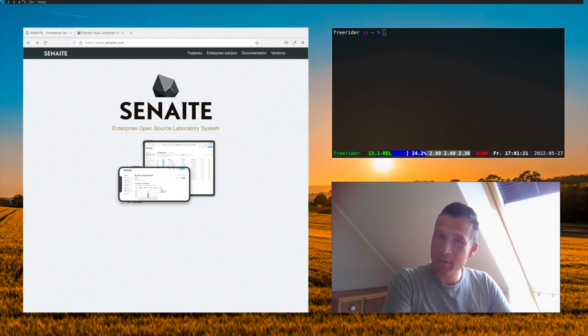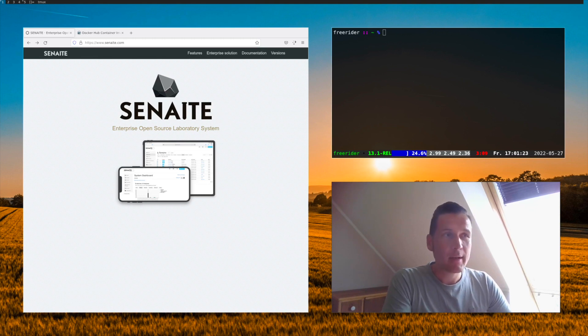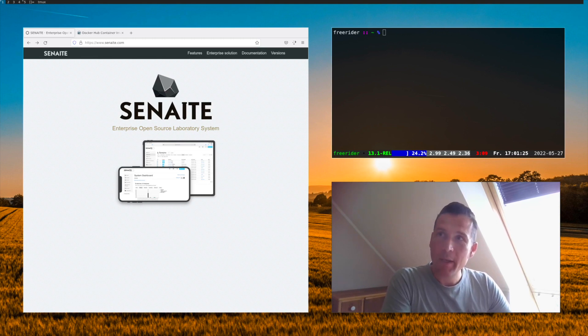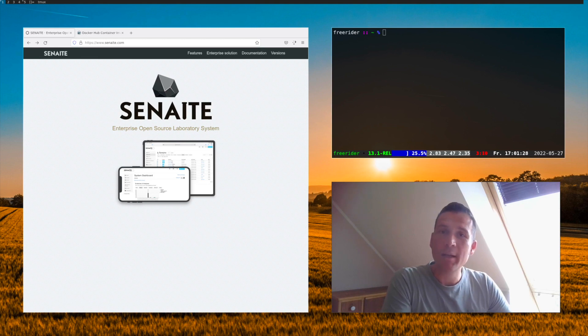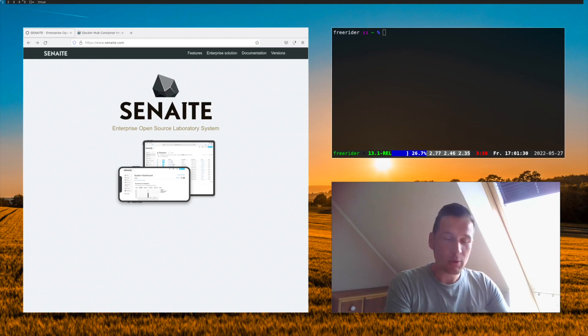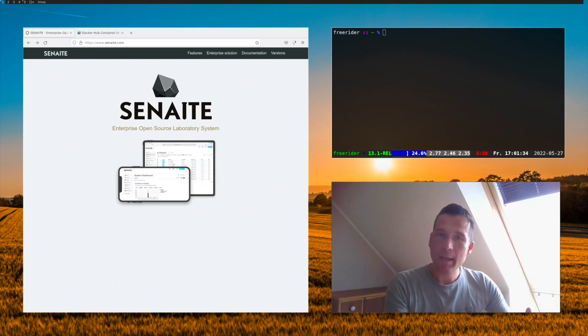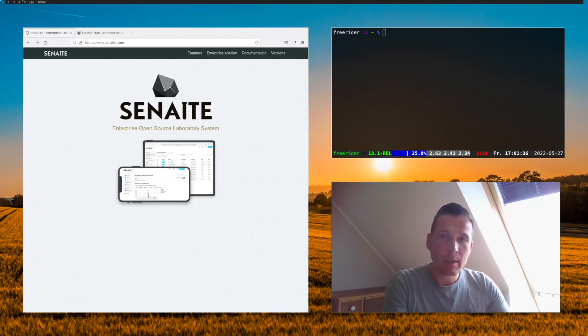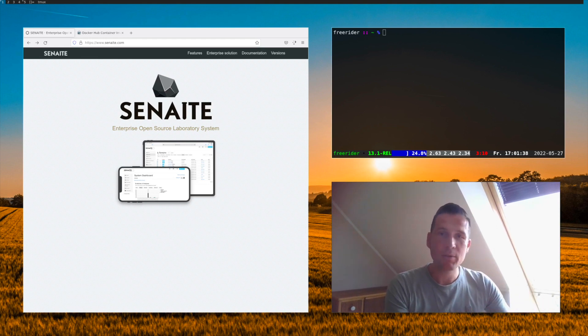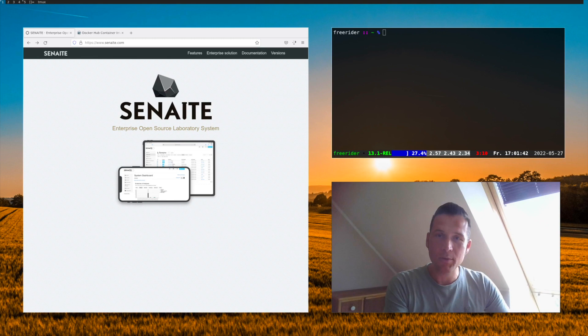Docker is a virtualization environment where you can download pre-built images from a Docker repository and run it locally on your computer. You don't need to care about manual installations or installing dependencies. You can simply download the pre-built container, run it, and you're good to go.